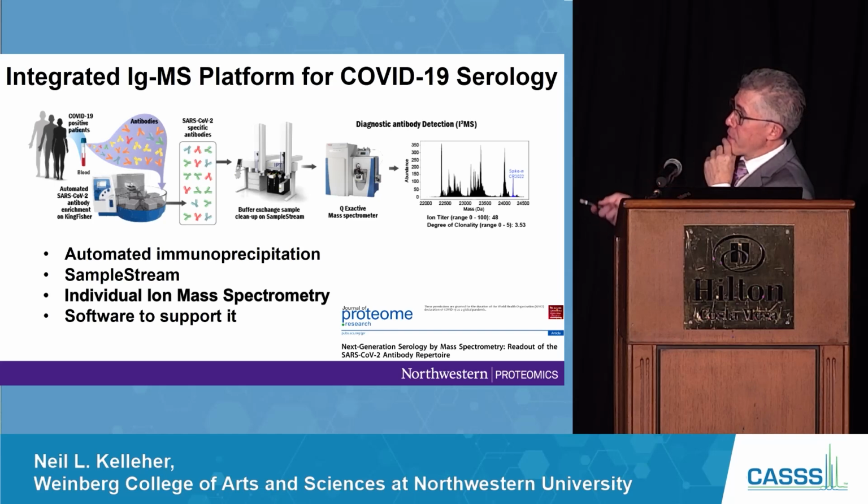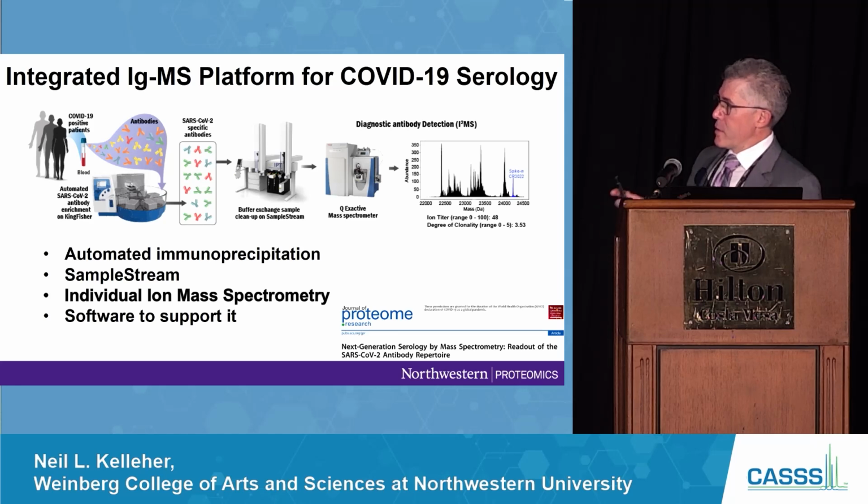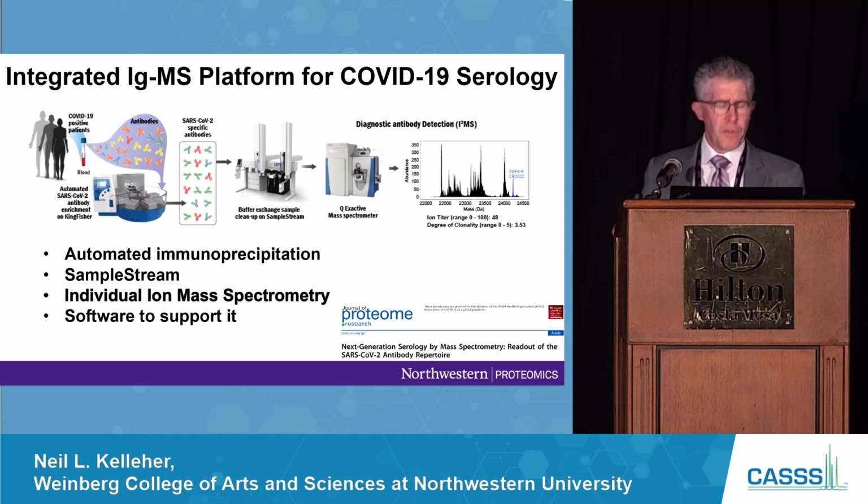And this is a really severe COVID patient where, with the spike in at 50 nanograms, you can see they have very high titers, lots of different clones. And so we had to create some new metrics to track that. And that's been published in 3 different papers so far.